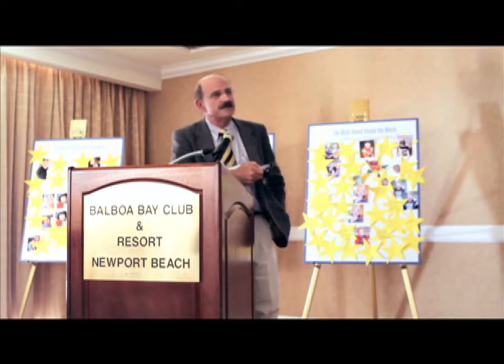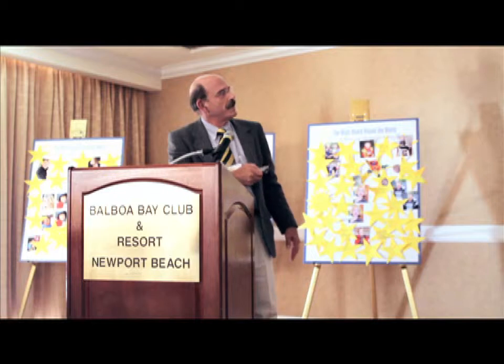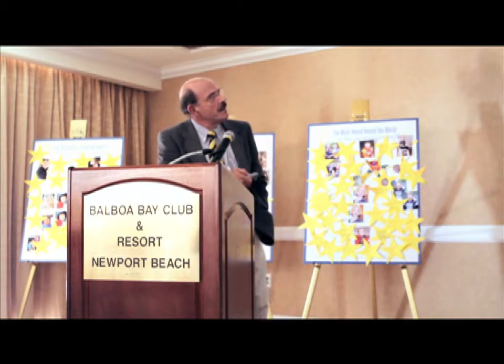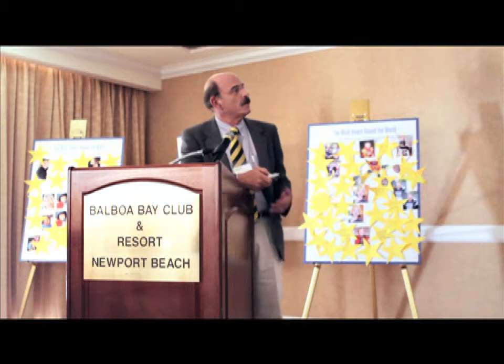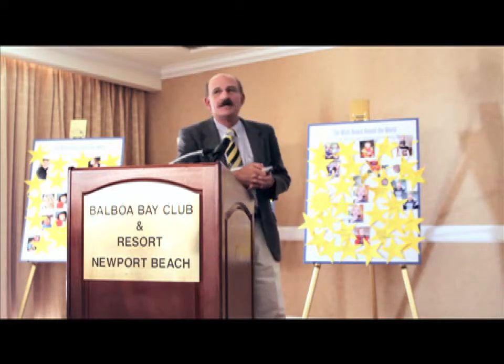So we've looked at eyes sequentially at different time points by sacrificing the animal, taking out the corneas, and looking at the cells and what's going on with the cells. And these are images, immunocytochemistry. Now these slices are similar in orientation to what you saw with the in vivo confocal images, and you see red nuclei, and then the green here is actin bordering the cells. The cells are these very large dendritic cells.